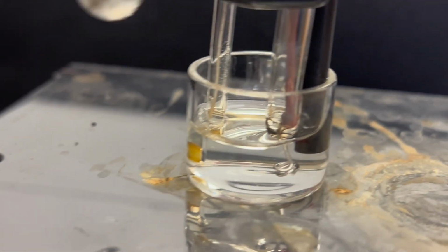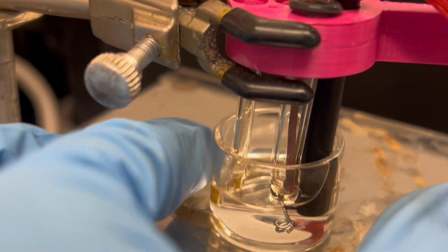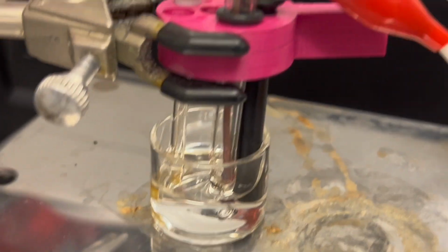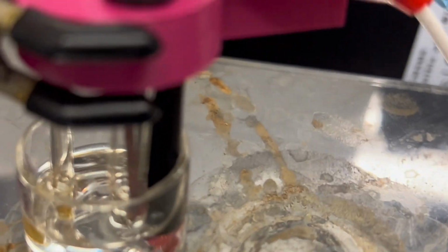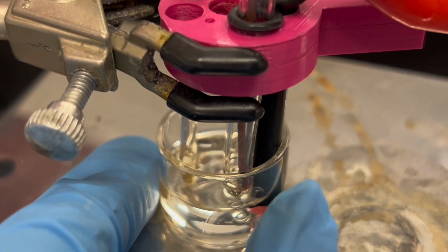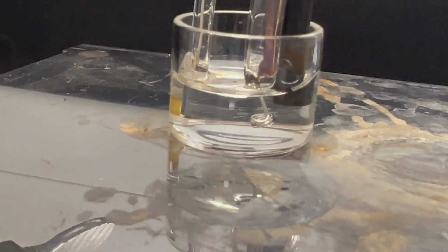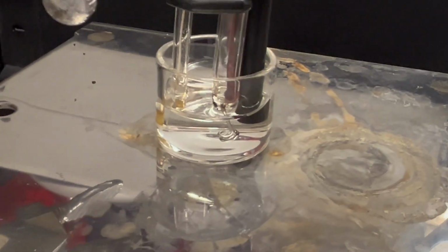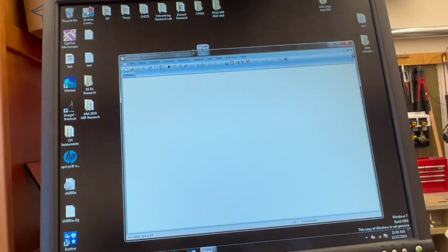If we're still not very satisfied, like if we could see the working electrode still a little bit touching the edge, then we could move it and do some little adjustment to make sure they're in a good place. And now they look like they're not touching each other, they're not touching the bottom or the edge. Now it's very good.